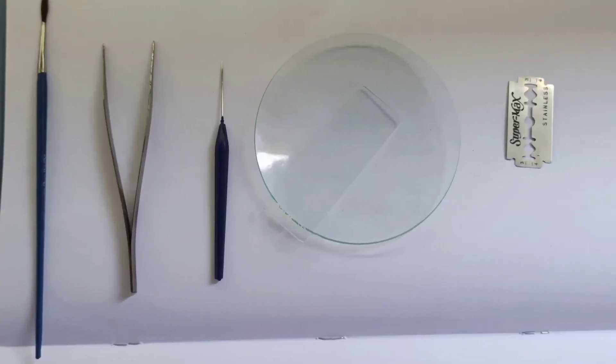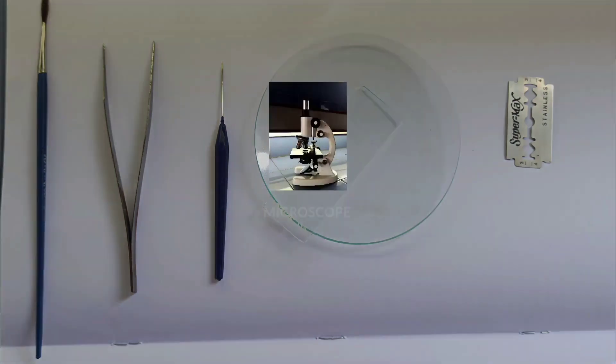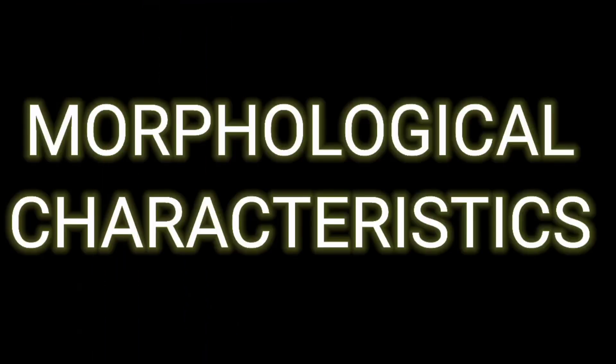Requirements needed to perform this experiment are: Brush, Forceps, Needle, Watch Glass, Slide with Cover Slips, Sharp Blade, and a Microscope. Chemicals required: Glycerin, Concentrated HCl, Phloroglucinol, and Chloral Hydrate. Now let's study the Morphological Characteristics of Clove.